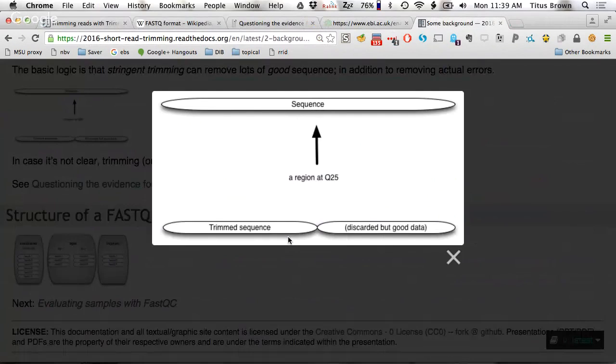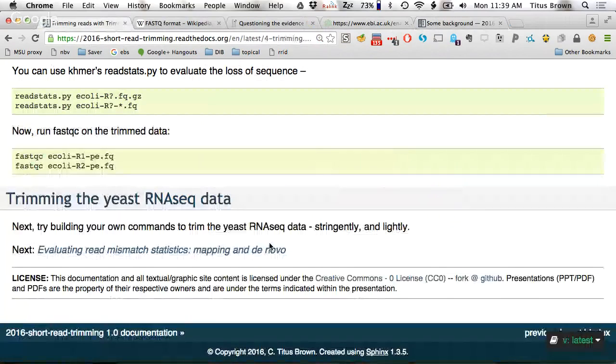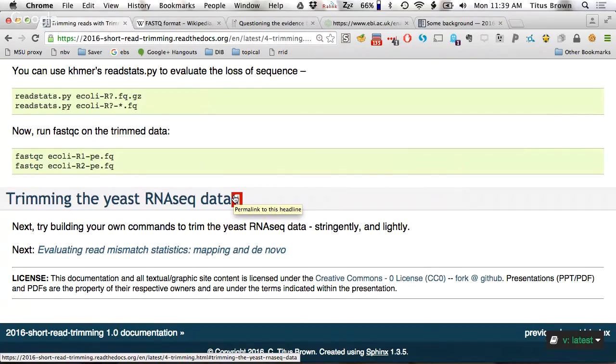Okay. So this is really the end of the trimming bit, and I wanted to show you my other favorite trick. At this point, you've got your sequence, it's trimmed in some way, you've looked at the FastQC reports, you know what your error profile is, and now you have to decide: are you going to do mapping, variant calling, quantification, or assembly? And again, there are other things you have to think about. But at this point, you've got your trimmed sequence.